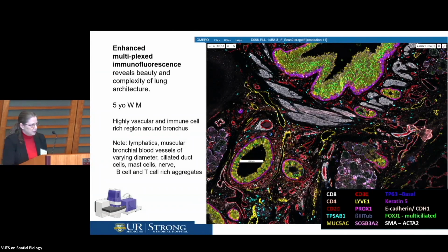As you know, recent technological advances have allowed us to identify and catalog with increasing granularity the various cell types, subtypes, and states in the human body at the single cell or single nucleus transcriptomic level. With advances in imaging technologies that Melissa showed beautifully in their mass spec work, detecting now hundreds to thousands of RNA transcripts in tissue sections in situ, and with increasing protein detection by multiplexed antibody-mediated methods and high-resolution mass spectroscopy, we can now see the beautiful organization of these cell types, 50 to 100 per tissue, up to 1,000 in the brain. So here I'm showing you a view. It's just art. But it also tells us quite a lot.